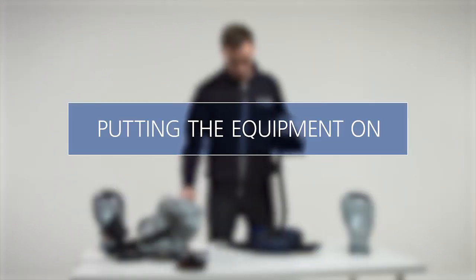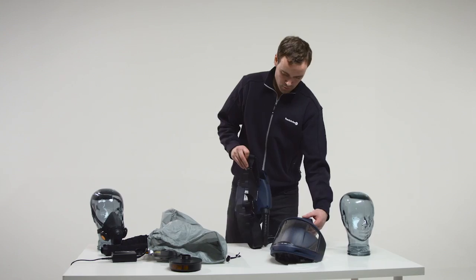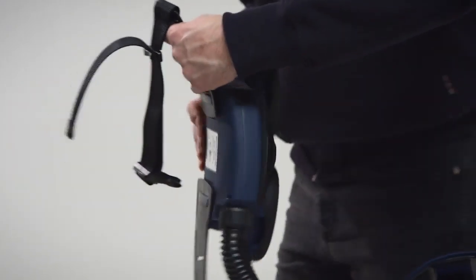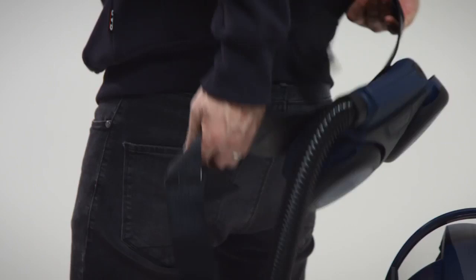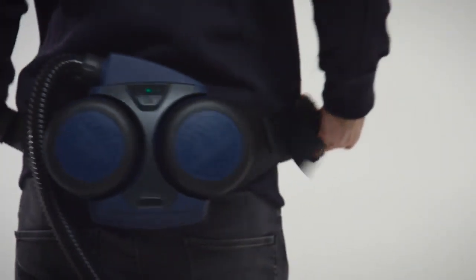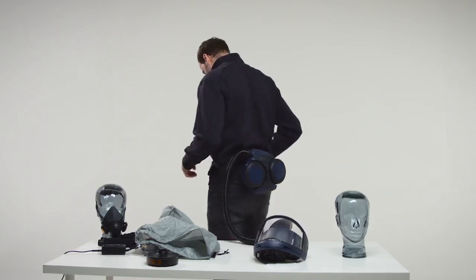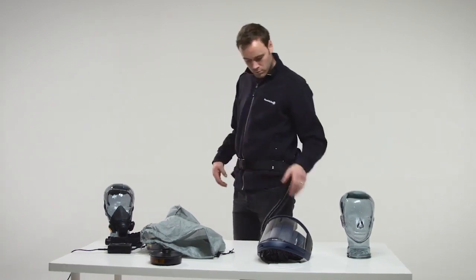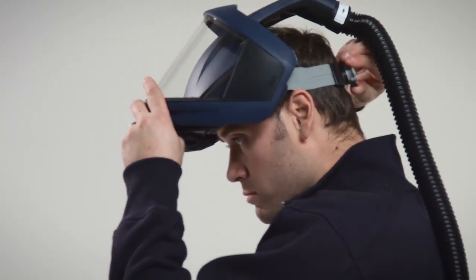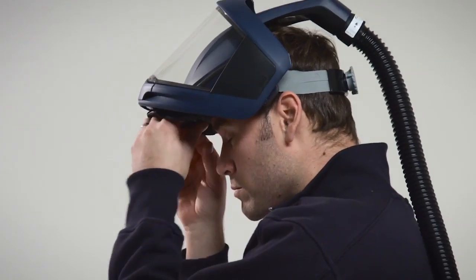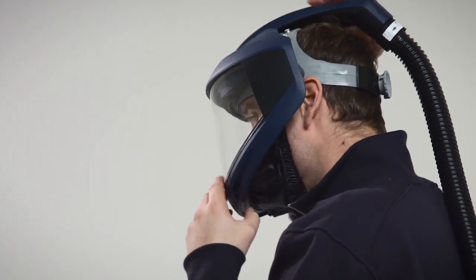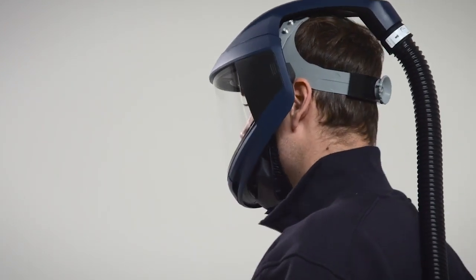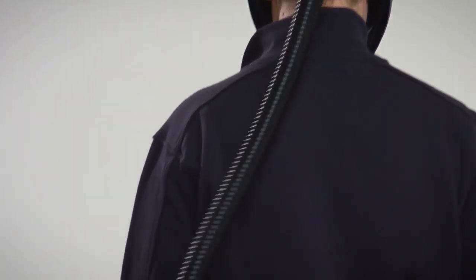Putting the equipment on. Take the fan unit on and adjust the belt so that the fan unit is firmly and comfortably secured at the back of your waist. Start the fan unit. Put the head top on. Make sure that the breathing hose runs along your back and is not twisted.